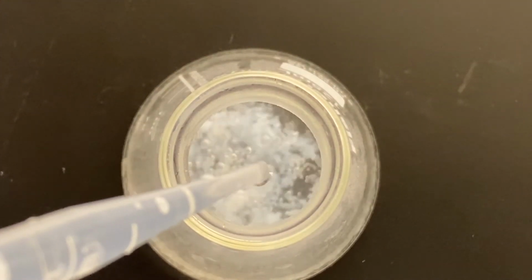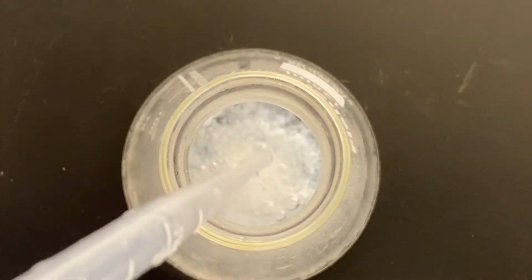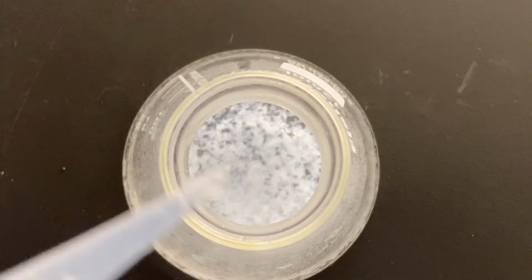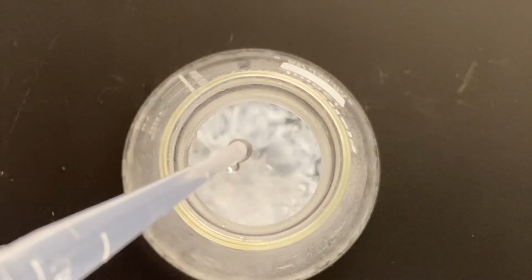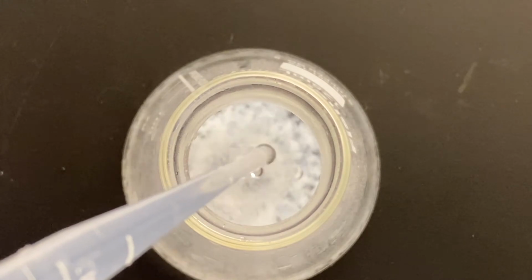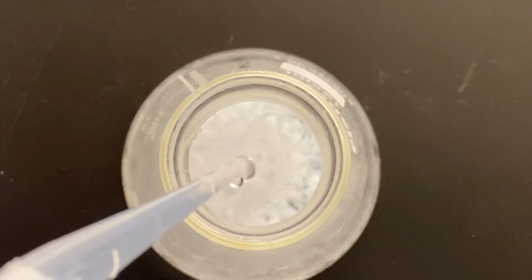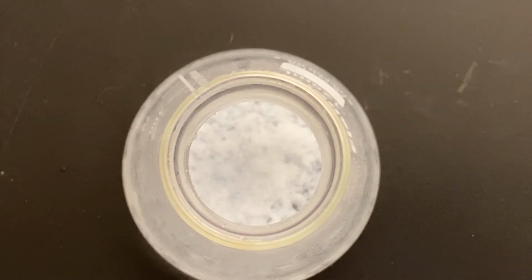But then as diffusion happens, the calcium carbonate redissolves because all of the carbonate will react with the acid that's still there. And so we have to add enough sodium carbonate to get rid of all the acid. Once we've done that, the carbonate ion won't react with anything else except combine with the calcium. If we add excess sodium carbonate, that's totally okay because we're just going to rinse it off anyways, because sodium carbonate is soluble in water.